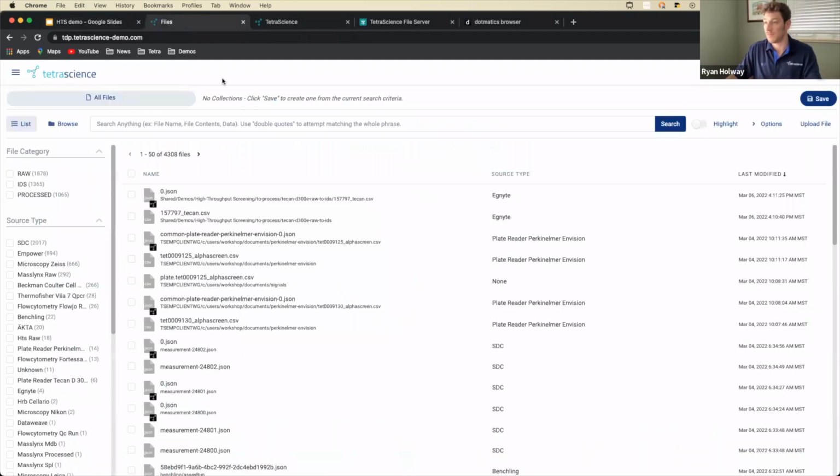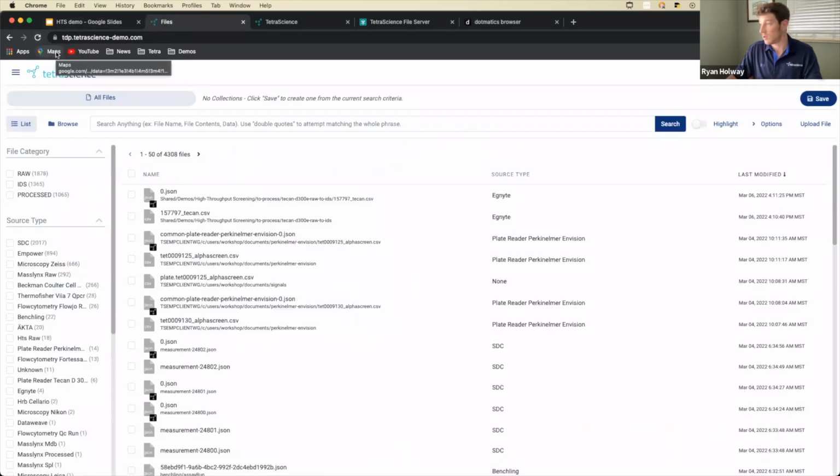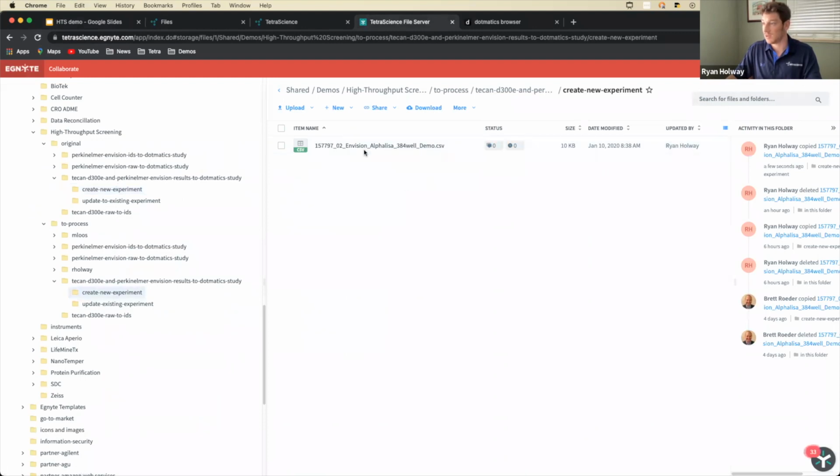Back to the platform, just refresh the page. Still waiting for that file to come in, it looks like. Let's just double check to make sure I dropped the file where I wanted. It looks like I did.